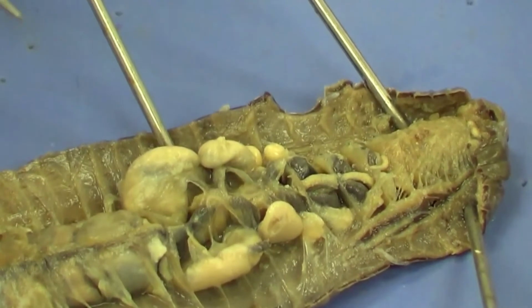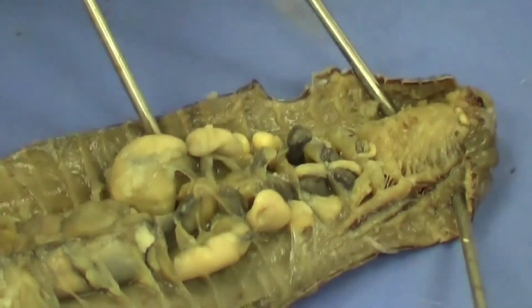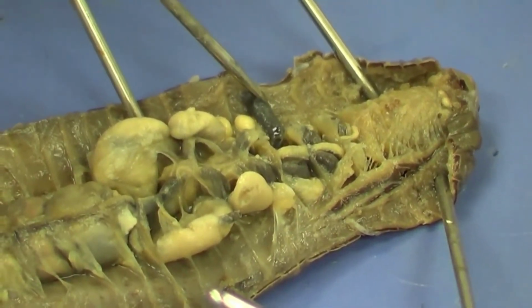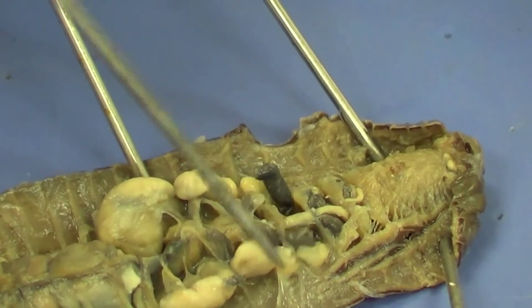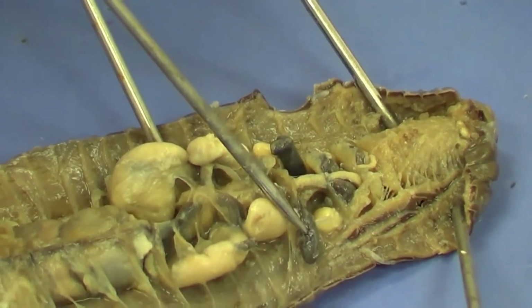And they're just going to be small black threads. Don't expect a lot. And you can see one right there. If we can zoom in on that right there, that is a very nice aortic arch. That's a very nice heart. That's about as good as it's going to get. You can see one on the other side also. If I can tease that out, there it is right there. Another very nice aortic arch.